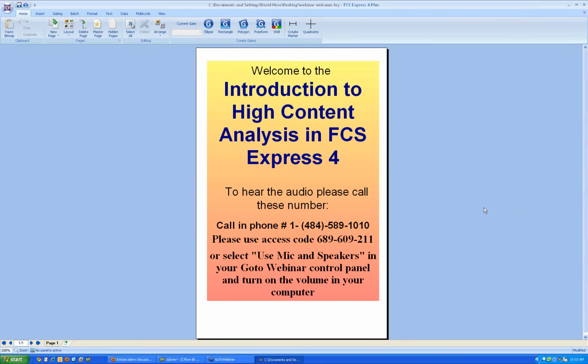So thank you everybody for attending the Introduction to High Content Analysis in FCS Express. The webinar today will be about 30 minutes and we will be showing off most of the new features of the high content analysis functionality in FCS Express.